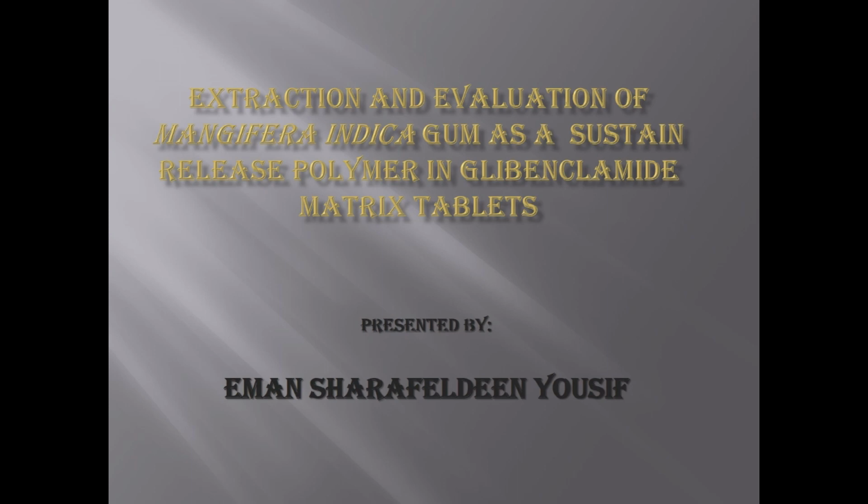Mangifera indica, the mango tree, has been known by its sweet fruit, and in domestic medicine, the tree has been used as therapy against chronic dysentery, also in the prevention of cancer, scabies, asthma, and bacteria. Well, today I'm going to talk about Mangifera indica from another scientific point of view, which is extraction and evaluation of Mangifera indica gum as a sustained-release polymer in glibenclamide matrix tablet.